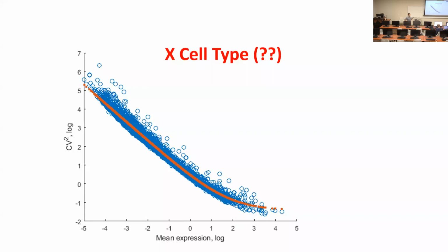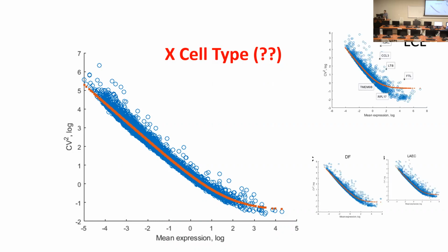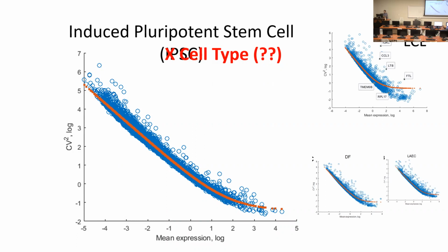Yeah, the variability is really low for all the genes. There's no biological variability in there. So they compare the different shapes. Okay, so that's the answer.